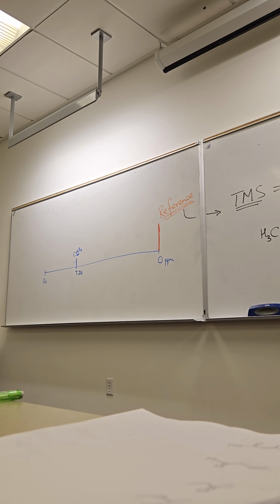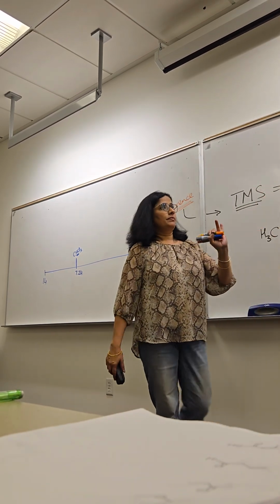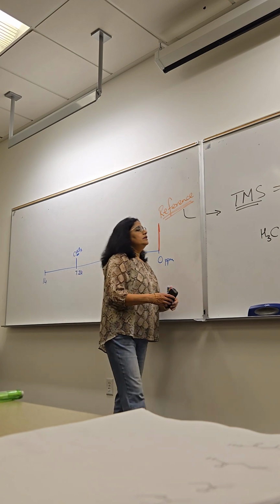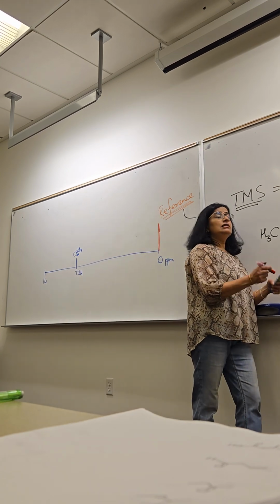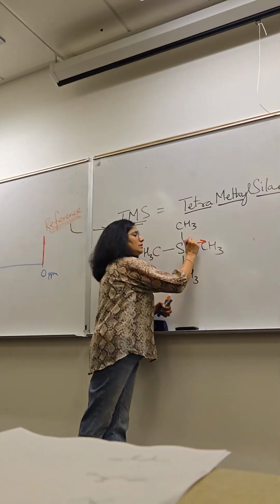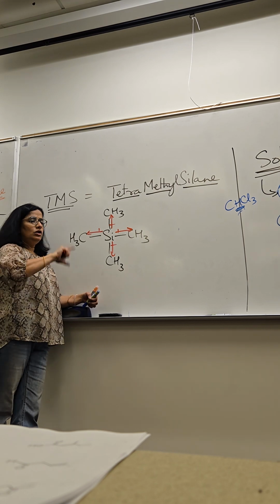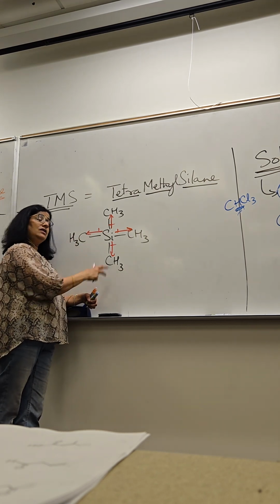So then, what's to stop us from, if it's an organic compound, just dissolving it in TMS? Couple of things that I can think of. Because silicon is low electronegativity compared to chlorine, that might affect the solubility of organic compounds in this.